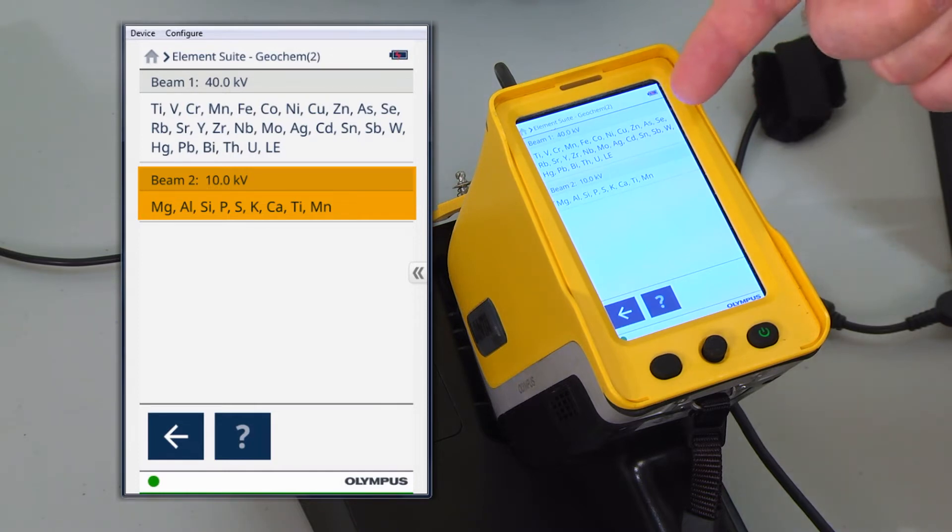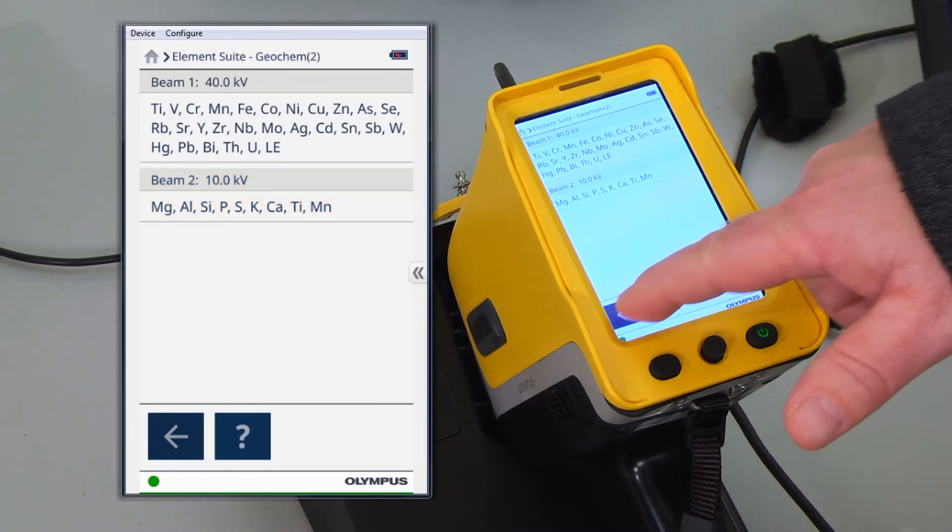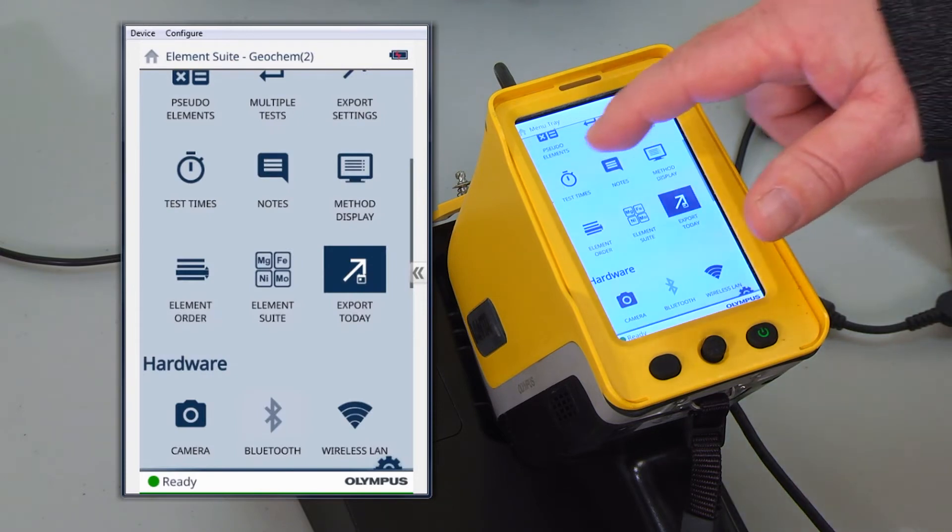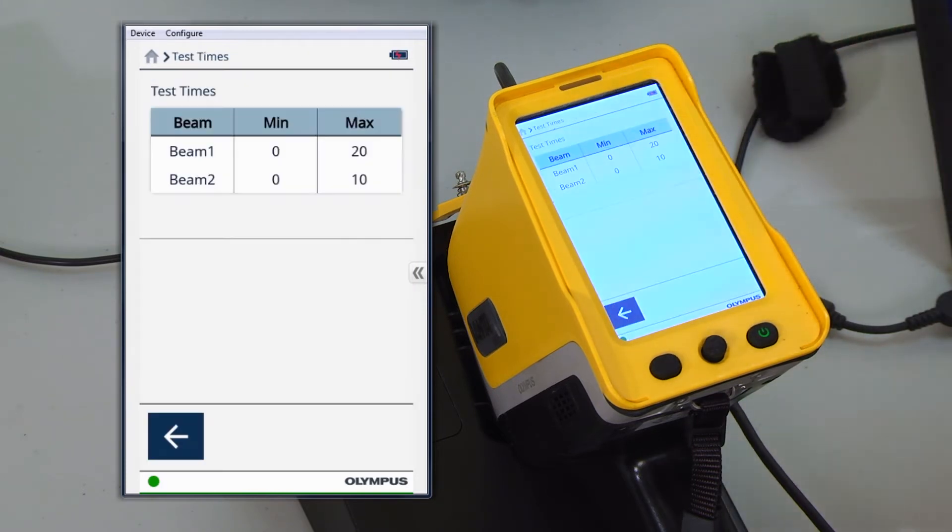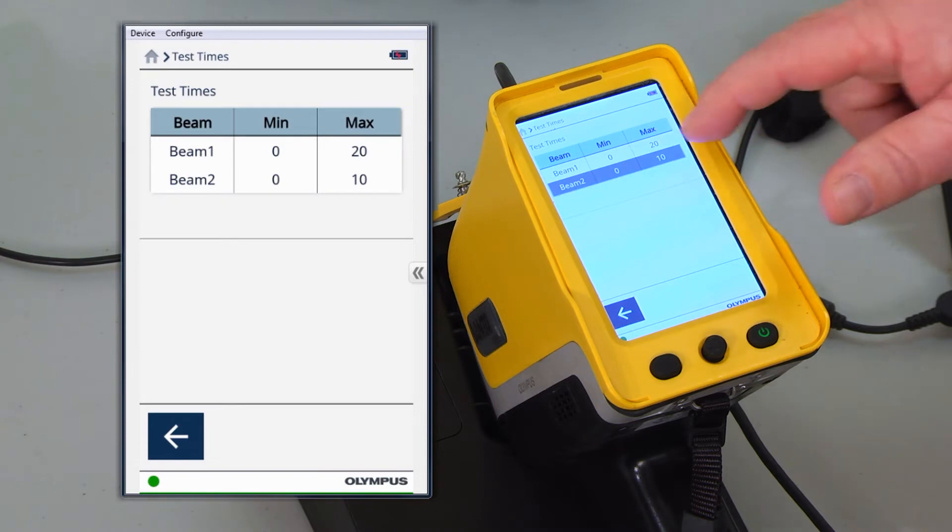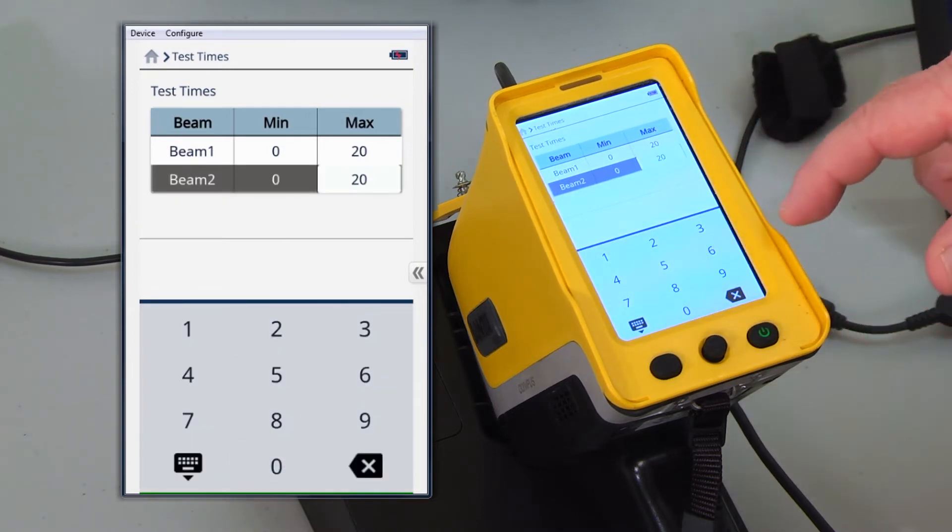So it's important you know which elements are optimised for which beam, so that if we need to make changes to the test time, we can simply do that by changing the test times in here.